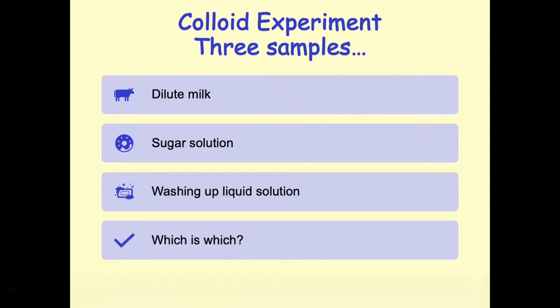Normally, when we do these lectures face to face, I do an experiment in the break. So what I'm going to do is that experiment for you now, and then we'll be able to talk about it at the lecture that we do live, the summary lecture that I do live next week.